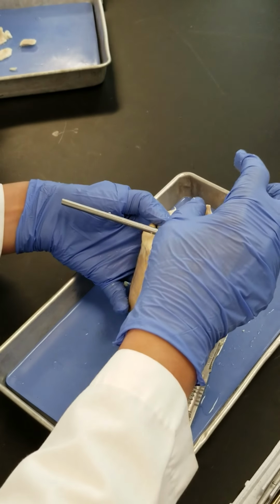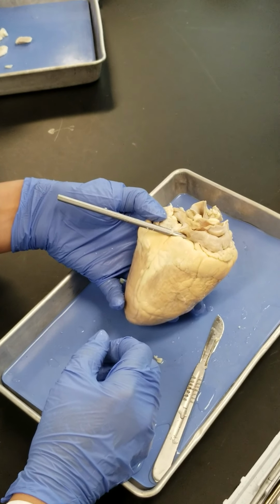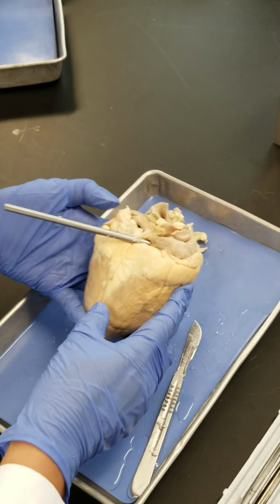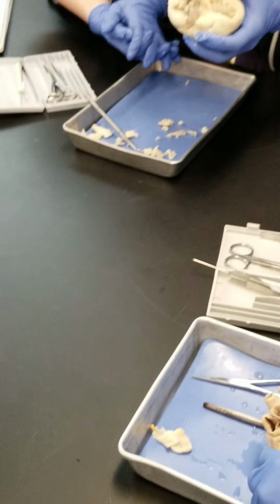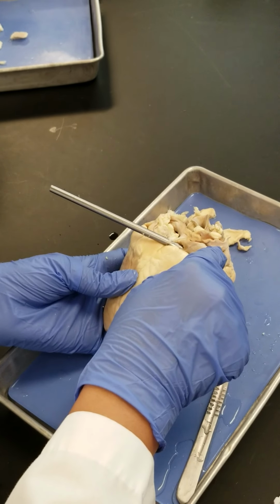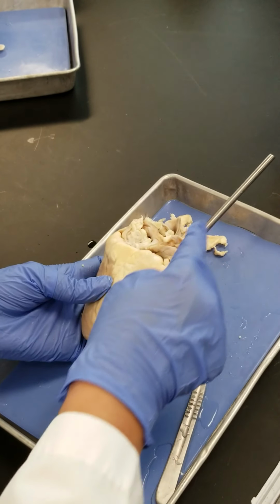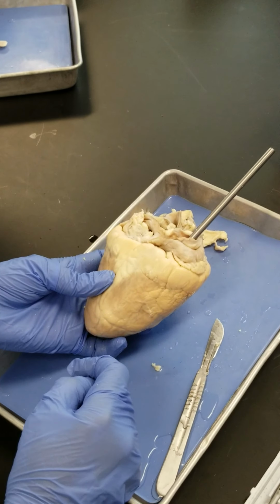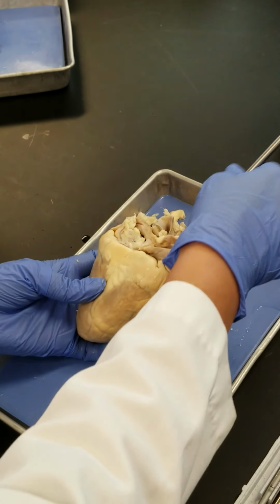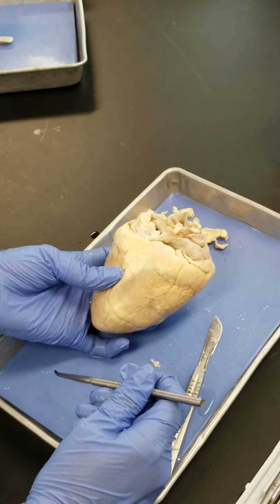Any question regarding the right atrium and the two vena cava that are going into it? We haven't found the inferior one yet. Pay attention to the direction that I put the probe inside. This one is going toward the right atrium. This one also is going toward the right atrium. This is the superior vena cava, that one was the inferior vena cava, right? Any question about the right atrium? Give it to me, I'll show you.